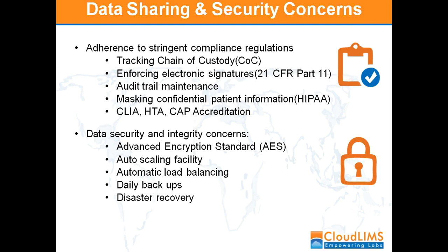So if you have a biobank, you have to adhere to strict compliance regulations. That is tracking chain of custody, enforcing electronic signature, audit trail maintenance, masking confidential patient information according to the HIPAA rule, and there is also a requirement of accreditation like CLIA. There are also some challenges about data security and integrity concerns, and that is the advanced encryption standard, which is not possible when you are using paper and pen to collect the samples and record their information.